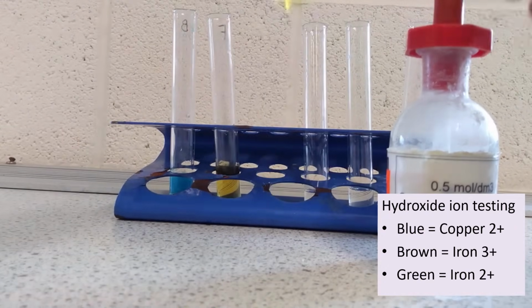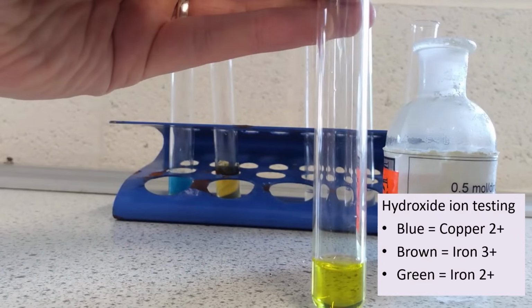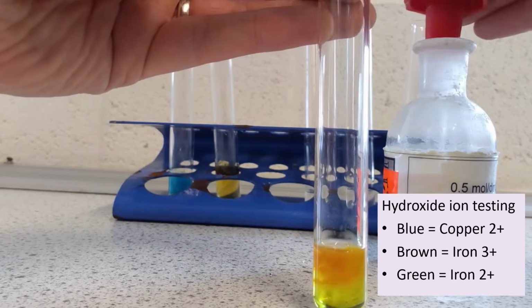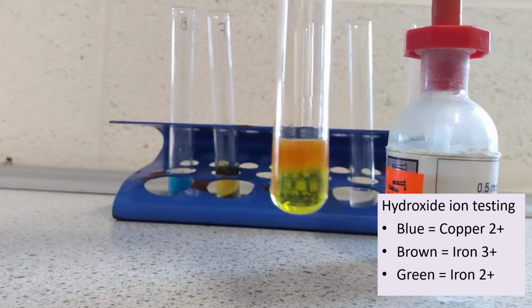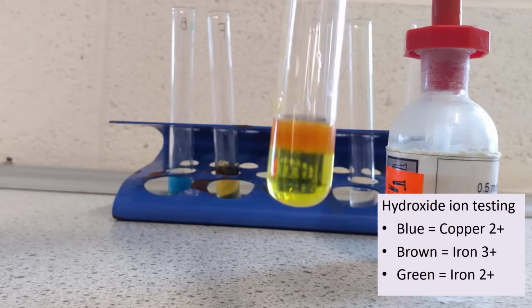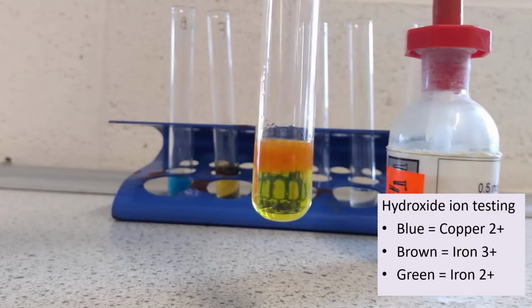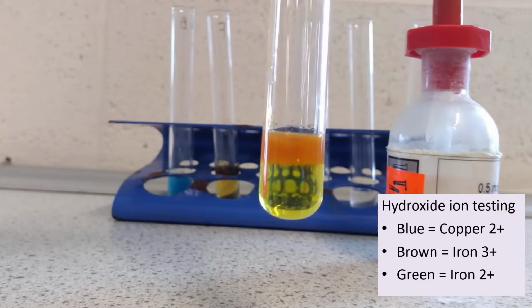And then in contrast to that, iron 3+ ions produce a much more orangey colour. So if you think about rust, that's hydrated iron oxide and it's iron 3 oxide. So, you know, this is rusty coloured because that's the colour that we would expect all iron compounds to turn.